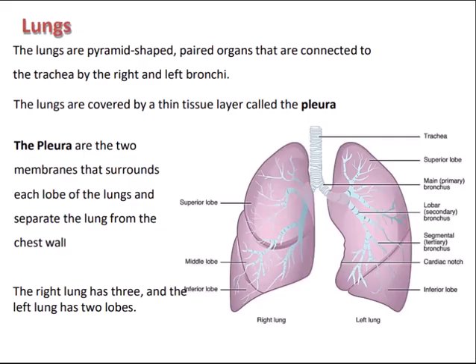As you can see, the airway epithelium, the trachea is pseudostratified ciliated. Alveoli are simple squamous. Then the goblet cells are present, cartilage, smooth muscle also. The function is conducting in proximal trachea, and alveoli are used for gas exchange.